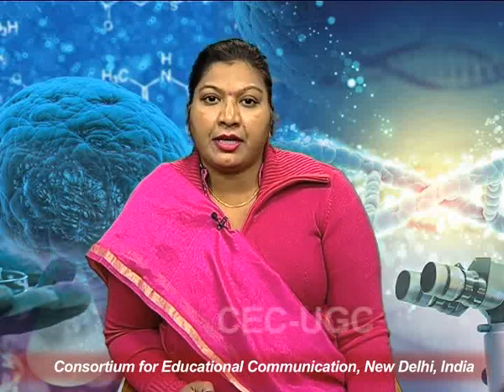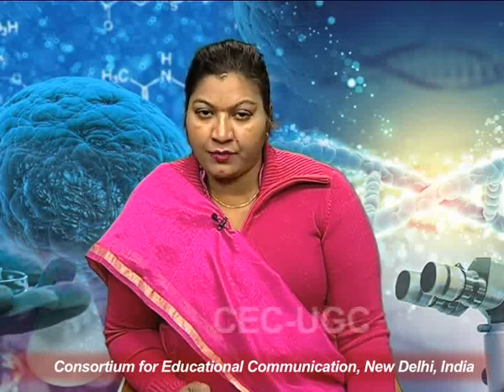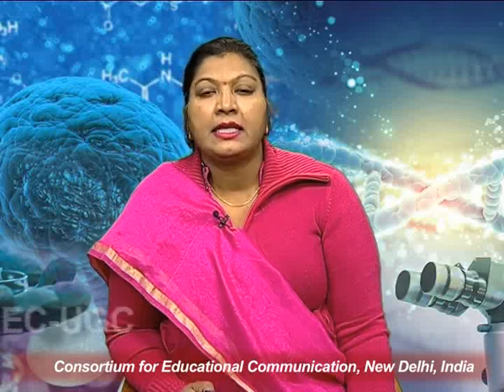Application of the Bragg's X-ray spectrometer: it is easy to handle. The adjustment of the angle can be done. Theta can be varied, and on the basis of that, we can find out the ionization current. Thank you very much.